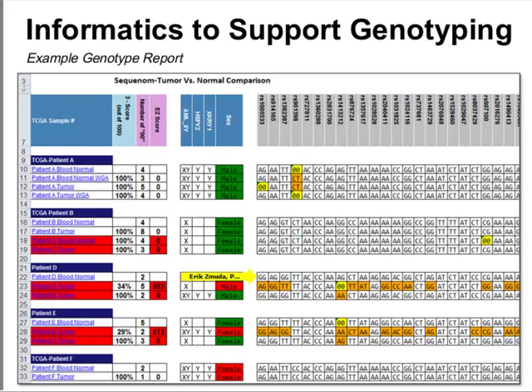So we wrote the rules to say what a male was by the genotype. If the rules were broken, then it doesn't change the call for the clinical data, but it just lights up that cell as red so that you look and say, well, that particular sample has a mismatch between the clinical data and the molecular sex data. So with that, maybe I'll just run through the examples here, and also say we also brought in all of the raw data so that we could visually inspect the actual calls for each of the loci.